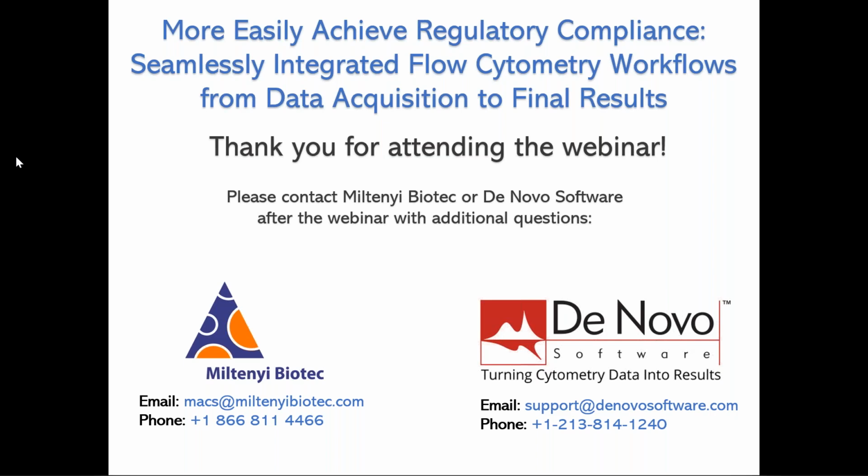Can the recipient computer then be set as the donor, or can different recipient instruments and systems upload their data to the donor system to change that around if need be?